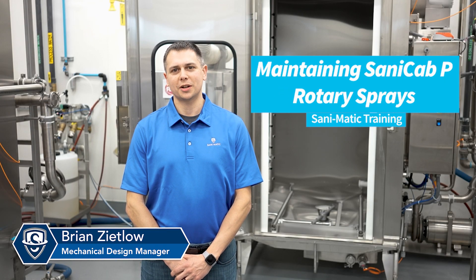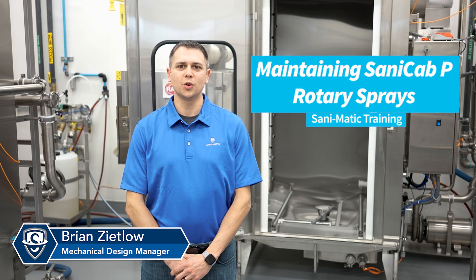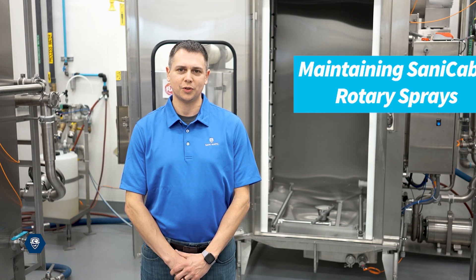Hello, I am Brian Zitlow and today I'm going to take you through how to remove and inspect a rotary spray manifold on a sanding cap.